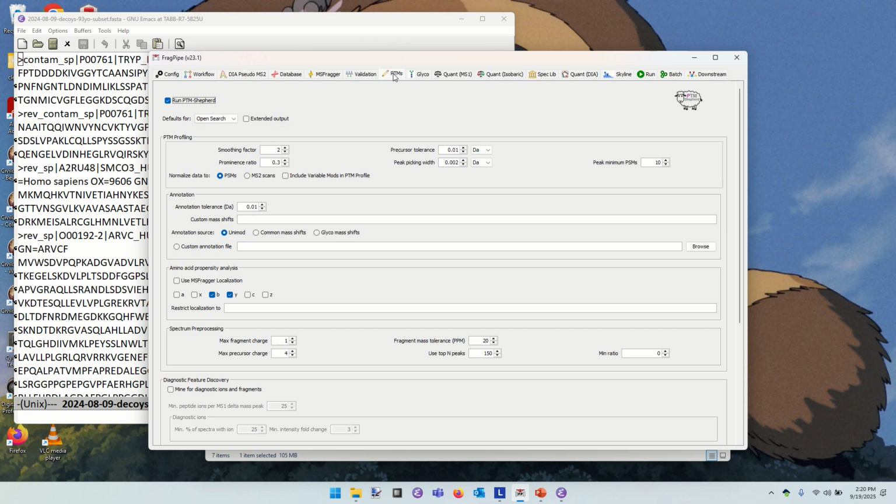You might be running your source a little hot. As a result, you might get some large peptides getting cut into pieces as they go through the source, and you end up with what looks like a semi-tryptic peptide. It's not because another crazy protease was at work. In this case, that's an electrical phenomenon causing your peptide to get broken up. So being able to find those, being able to account for those is handled by Crystal C. It's able to recognize semi-tryptic peptides that show up in a tryptic search.